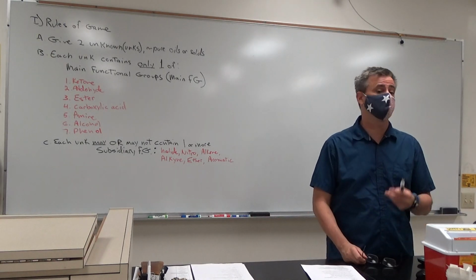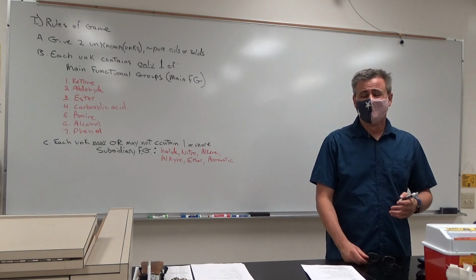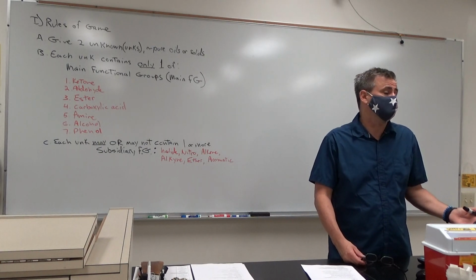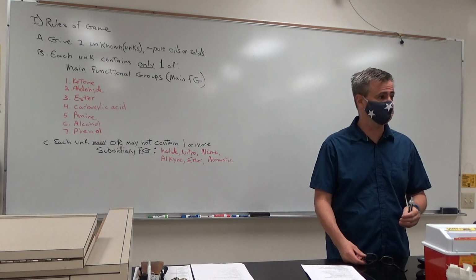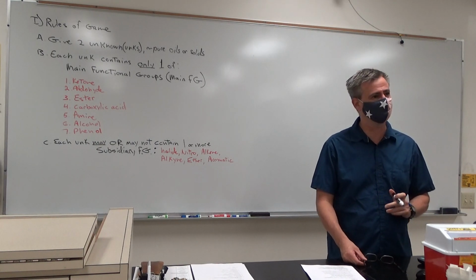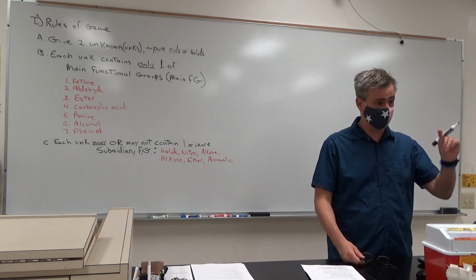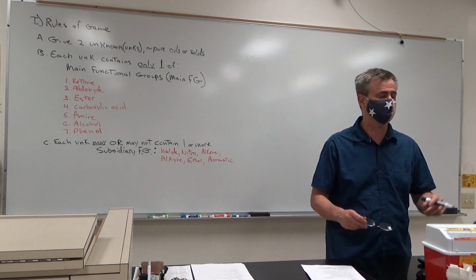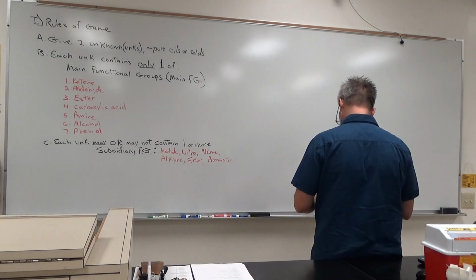Also, melting point and boiling point don't give you a lot of general information, but they do give you great information in terms of confirmation. If I think this is butyric acid, well, here is butyric acid's boiling point, so it ought to be close to what the literature boiling point is for butyric acid. All right, let's put stuff on the board.